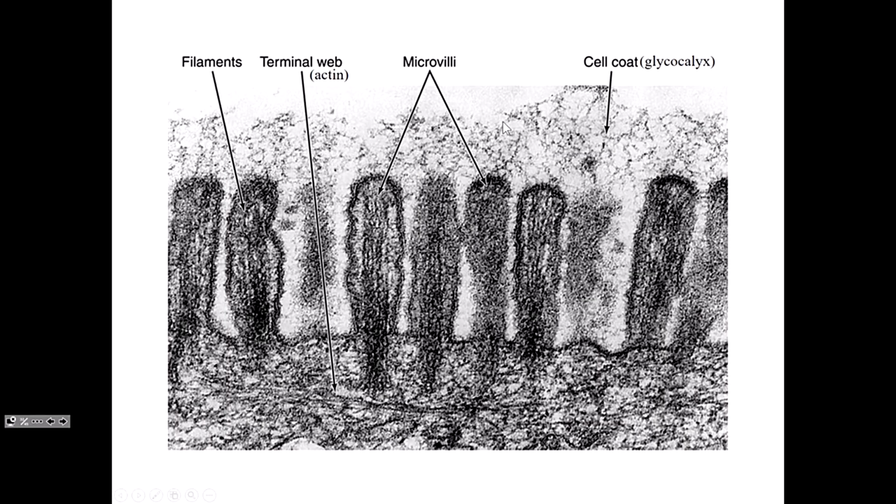And then with an electron microscope, we can actually look at a section through those microvilli. Okay, so you can see here, so here's the apical cytoplasm, the plasma membrane surrounding this one particular microvillus, shown here. And we can make out a couple of different structures now in and around the microvilli. We can see inside the microvilli, and it contains actin filaments. And we'll talk a lot more about that on Wednesday. But that's characteristic of microvilli and stereocilia, actin filaments.